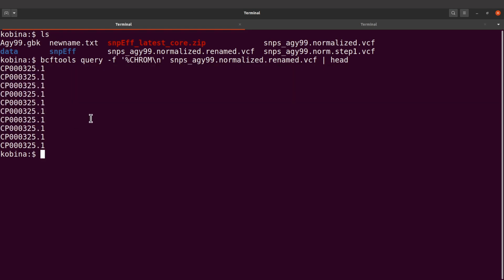Now let's do one more check. All right. So let's ls into the SNPEFF database again. So I'll say ls, and I'll say SNPEFF /data/AGY99.